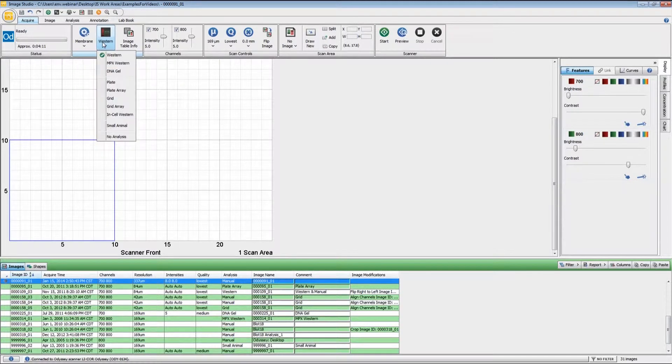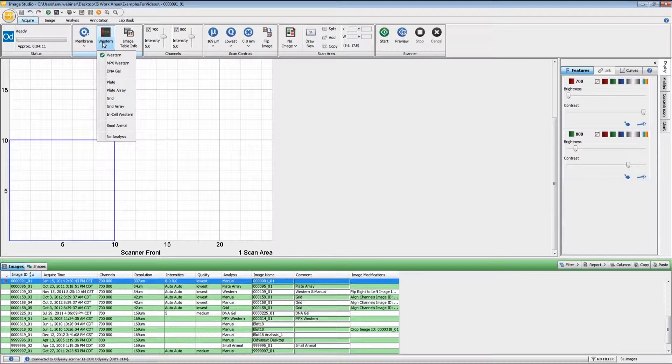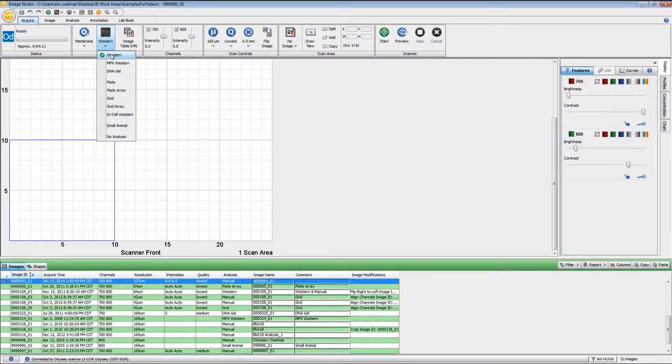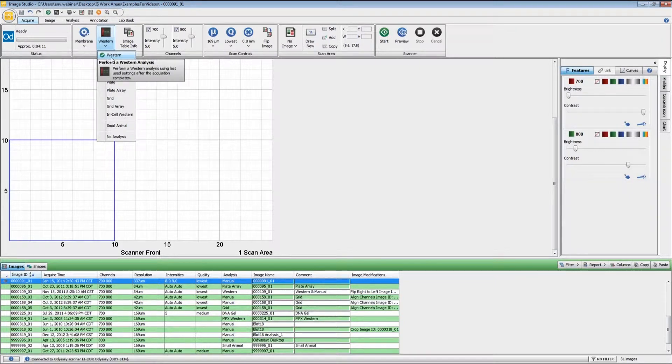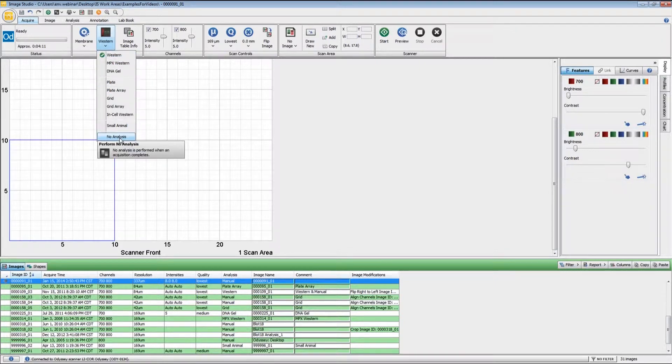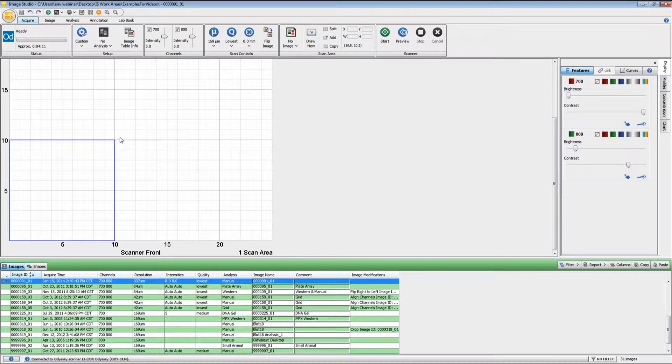The next pull-down is for the analysis type, and you can preset the analysis type before you do the scan. If you know that you're going to be doing a Western analysis on this particular image, you can preset that right here. I'm just going to go with no analysis right now for simplicity, but you can change the analysis type at any point after the acquisition also.